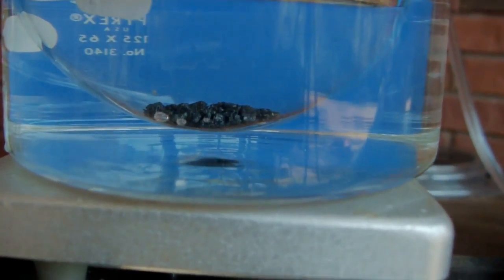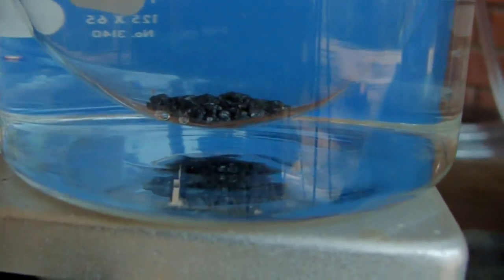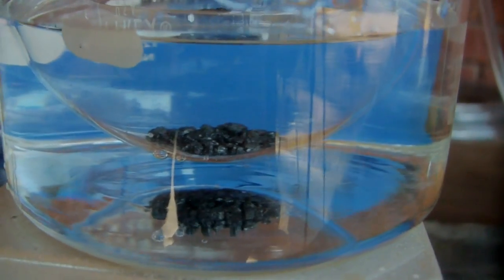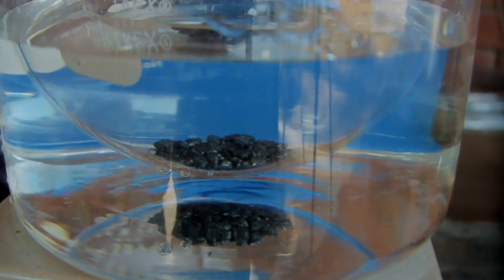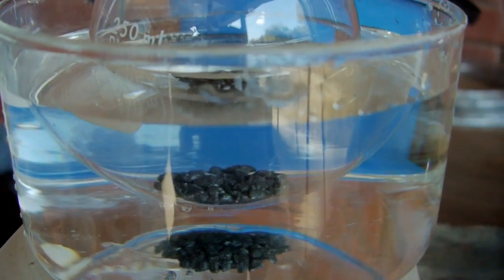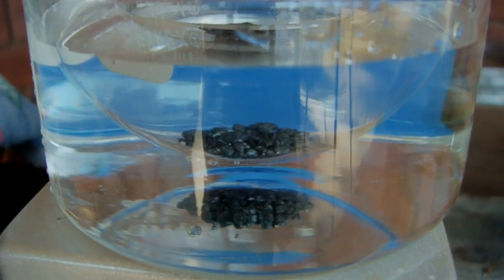Also in the reaction flask, I have some boiling chips. They're porous carbon pieces that assist in boiling. They provide nucleation sites for bubbles to form on so that the liquid doesn't superheat, and then when you tap it, it can violently boil and spew liquid up out of the top. So it's always a good idea to have boiling chips.